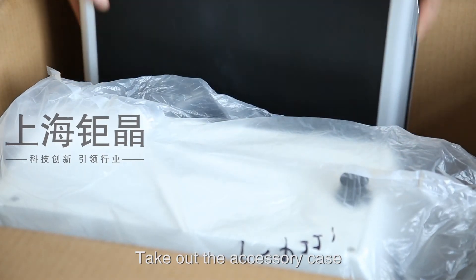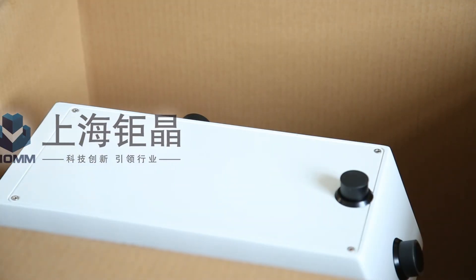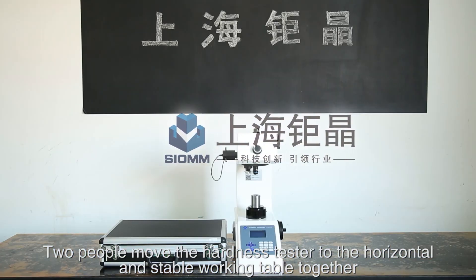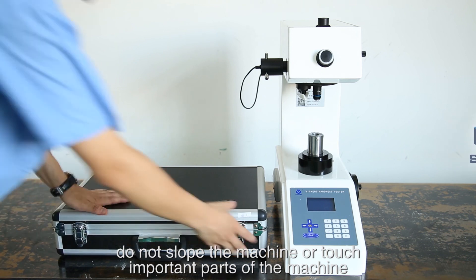Take out the accessory case and remove the protection bag. Two people should move the Hardness Tester to a horizontal and stable working table together. In the moving process, do not knock the machine or touch important parts of the machine.